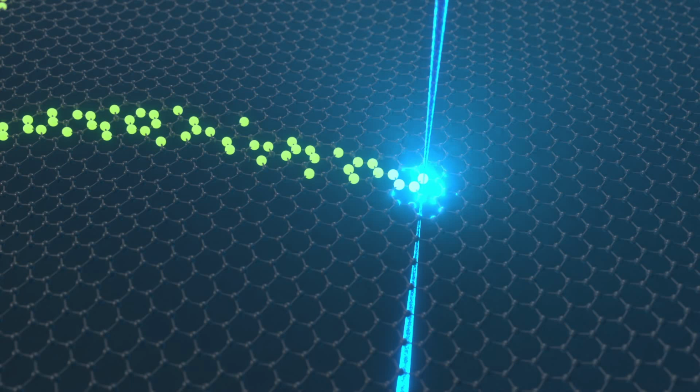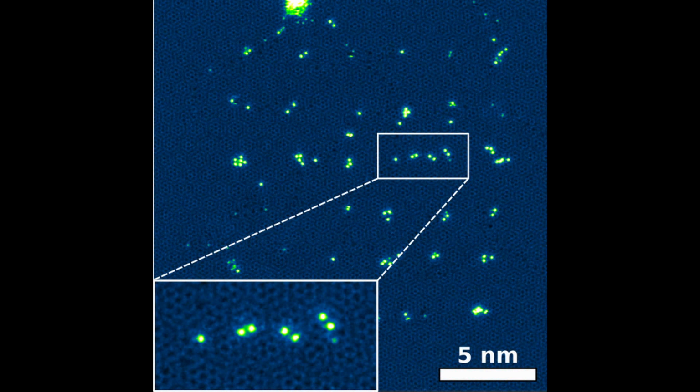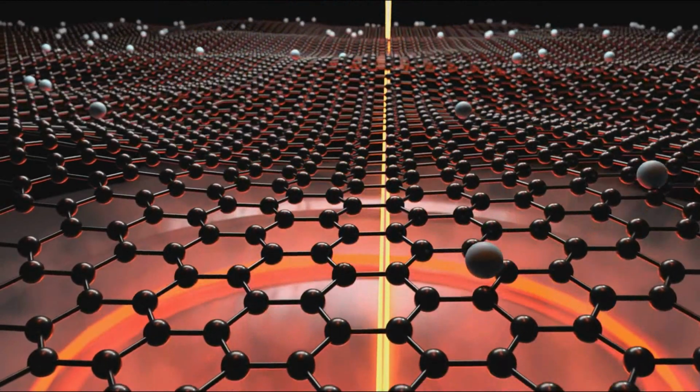If we abandon the idea that we must dissociate a precursor gas, we can instead simply consider what would be required to drive a reaction in the CSE that would result in the deposition of a single atom. In fact, we already have examples of single atom deposition. Here, the electron beam was used to damage specific locations of a twisted bilayer graphene sheet. At the same time, the sample and nearby copper nanoparticles were held at around 1,000 degrees Celsius, which promoted the evaporation and diffusion of copper atoms to the damaged locations, where they could chemically bond to the surface.